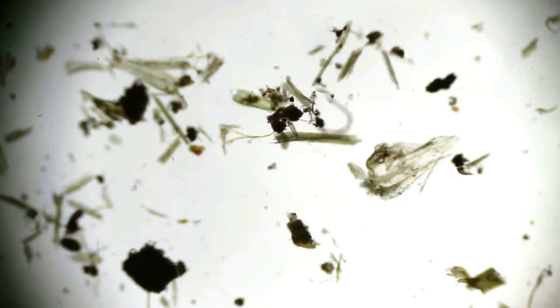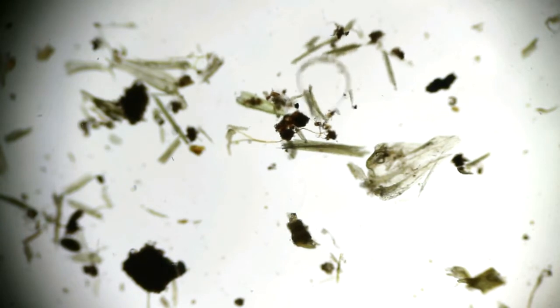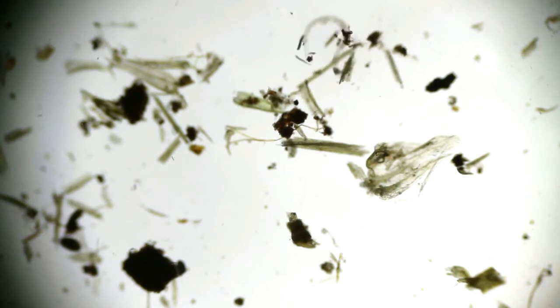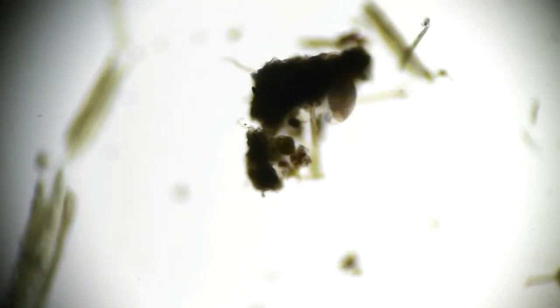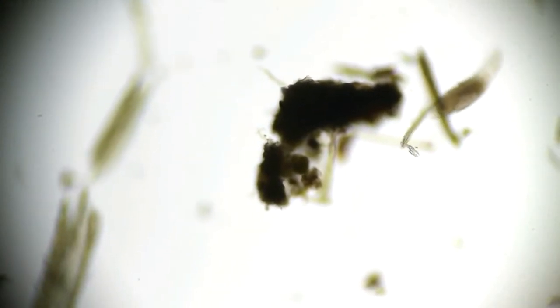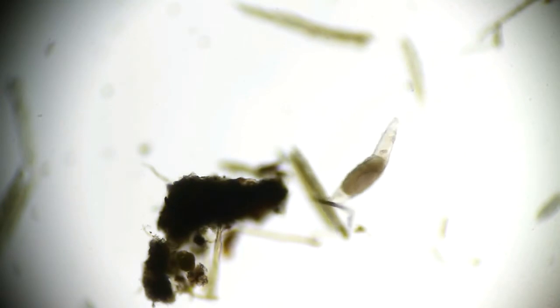And there's a little nematode worm. Always find these in these sorts of samples. Tardigrades can actually eat nematodes. This is a rotifer. I think rotifers are really adorable as well. I really like finding them. They're just very active though, won't stay still. And moving, so we won't stay in focus either.